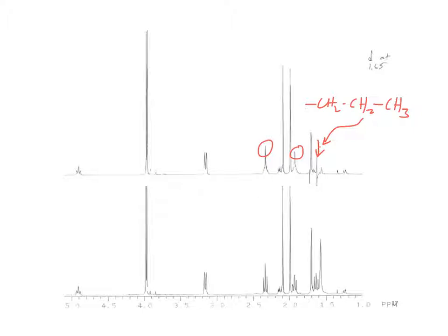These types of experiments are pretty quick and easy to run, if you only need to know a couple of different couplings. You know, Stephen, this is something you could do on some of yours when you have those mixtures. If you know that one signal doesn't have overlapping signals, you could go in and decouple on there, and you could clearly see what changes in some signals that are overlapping with each other.